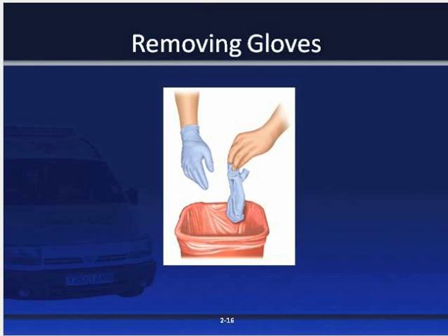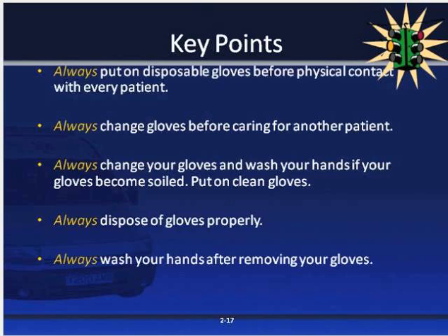What you're going to do is take the remainder of that glove that's in the left hand and put it in the right hand. And then you're going to take 2 fingers from your left, slide it underneath your glove, and then slide that other glove off just like you did with the other one, if that makes much sense.